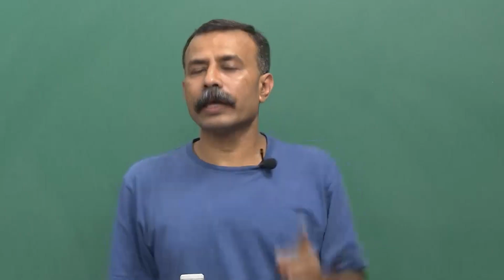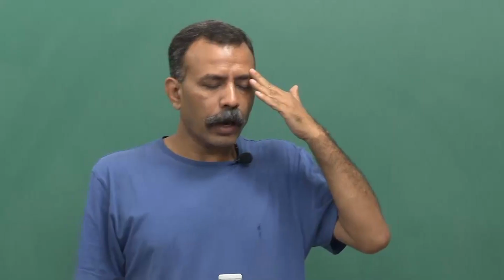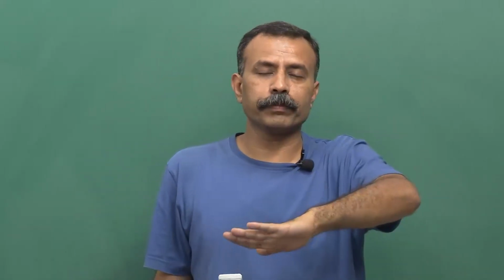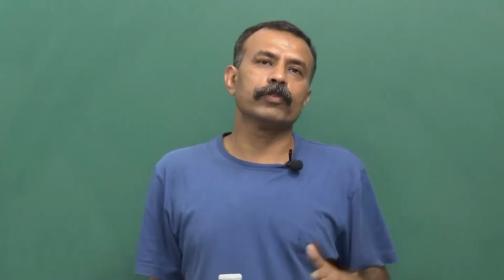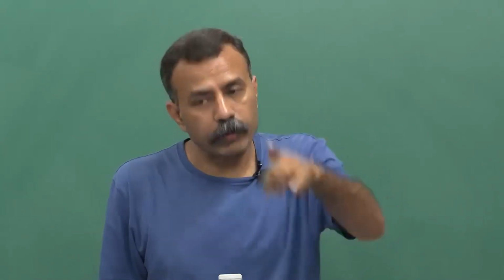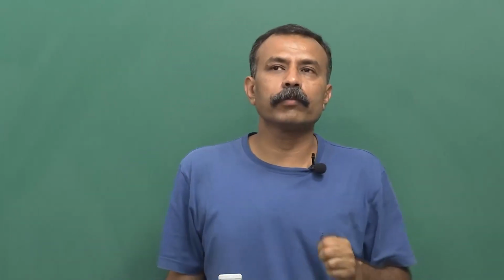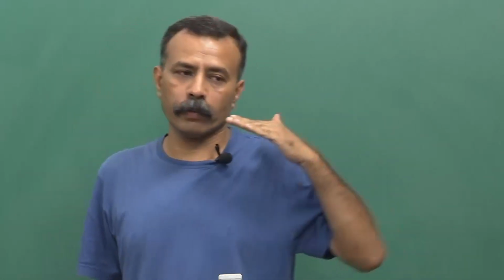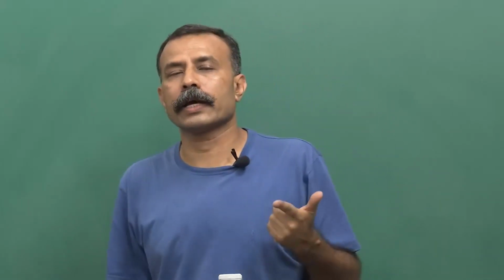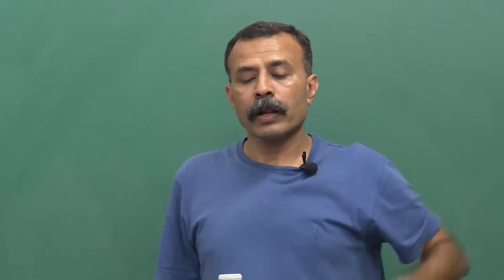They will not take into account what problems you are going to face. Either you have to be upfront and very clear that this is the kind of sample I have to visualize, and you convey that to them, or you explore it by yourself, because this is a pertinent problem I have seen over the years when we have set up labs. One negligence on our side cost us very dearly. Why did we do it like that? We should have done it the other way. Okay.